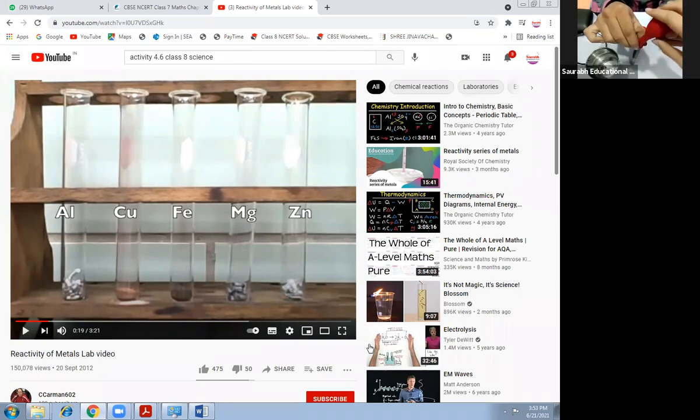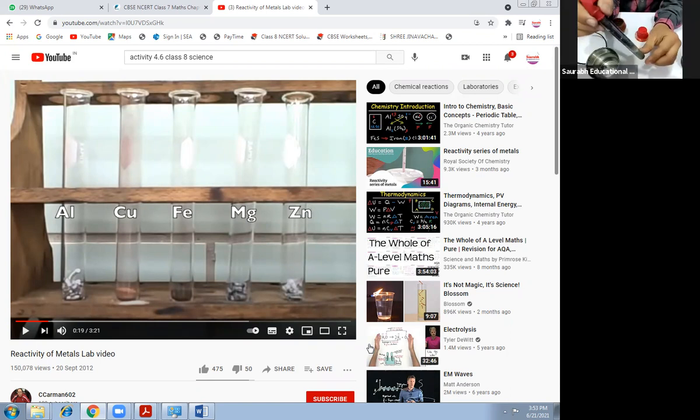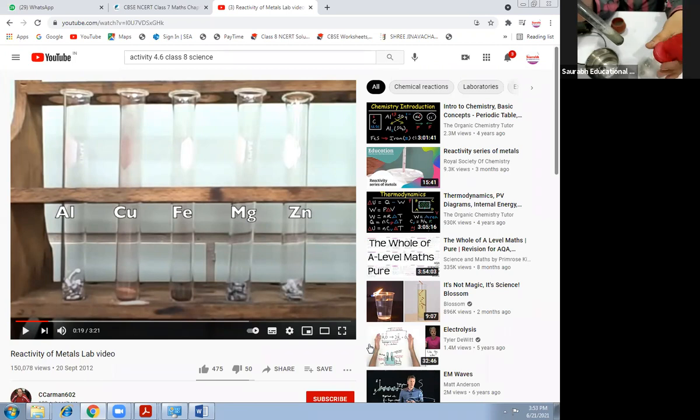See. This is a gas filled in it. I think we have taken in a less quantity. If we take more quantity, it will inflate properly. Okay. Yes, it will inflate properly. Clear? Okay. Let's move forward. Zinc. It is still there. We are waiting.